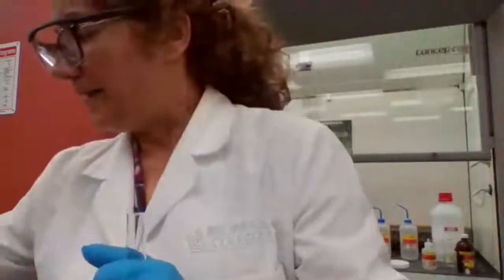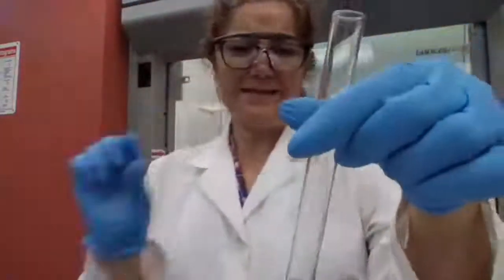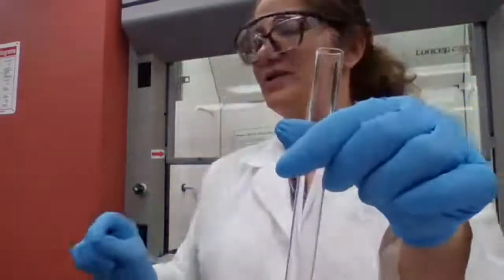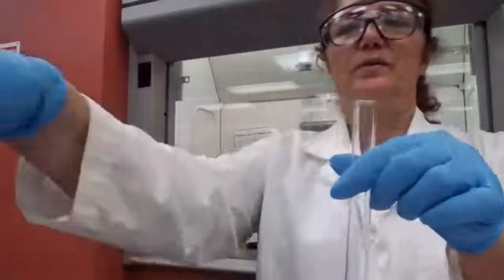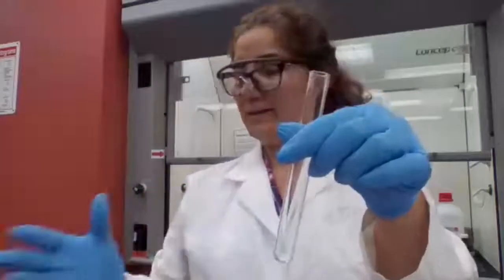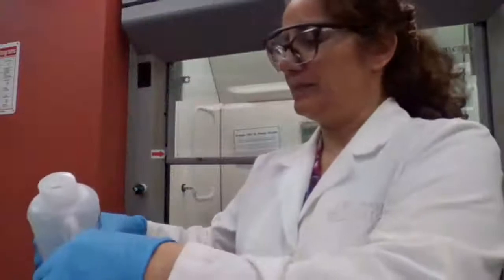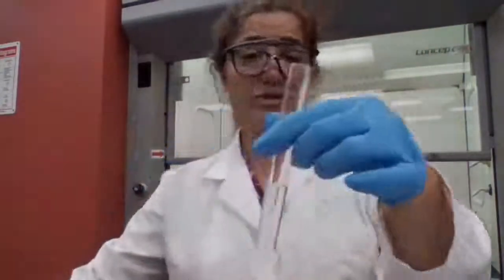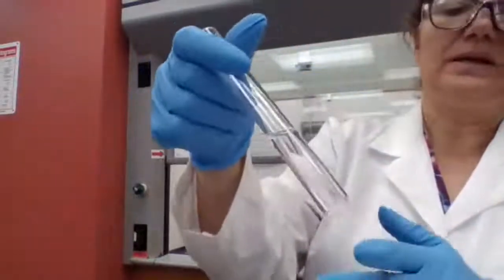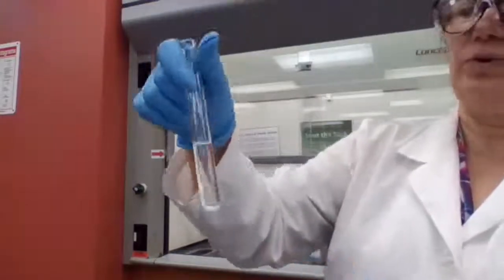Okay, about 0.1 gram of the sample, with like a tip of a spatula. Tip of a spatula is actually a very small amount. If we use more than a tip of a spatula, or 0.1 gram, with 5 milliliters of the solvent, it can saturate the solution. If the solution is saturated, then it's not going to be easy to recognize if it's soluble or not.